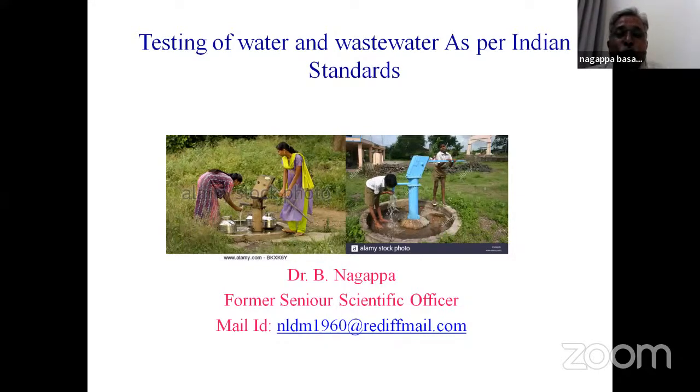Generally, we use the 4A theory. 4A means accuracy, acceptability, accountability, and applicability. The 4A thumb rule is generally what we follow for any method. Out of these methods, Indian methods are really very good. Throughout India, we follow Indian standard methods for testing of water and also wastewater.